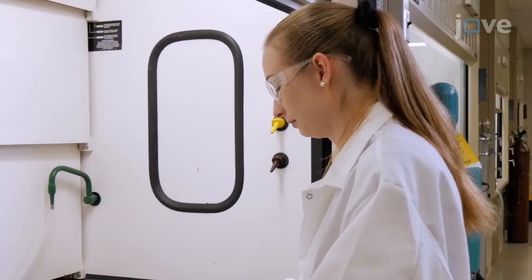Our protocol allows researchers to isolate bioactive signaling molecules used by reptiles in chemical communication, as well as the separation and purification of these compounds for additional testing or even identification. Using this method, researchers can obtain a source of chemical signals and then extract them for their quantification or bioassay use in isolation. Demonstrating the procedure today will be Holly Rucker, an honors thesis student from my laboratory.